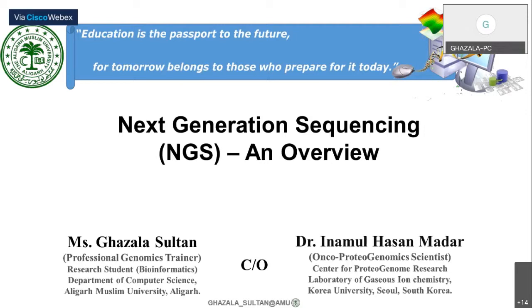So I will be taking this lecture as an introduction to next generation sequencing, which will be an overview of the course, not exactly in depth on next generation sequencing. So let's see just the overview.